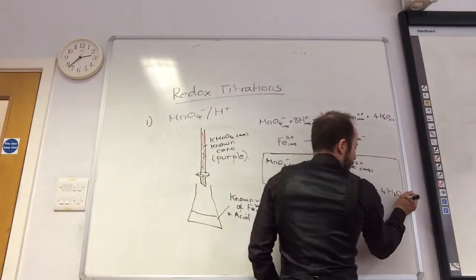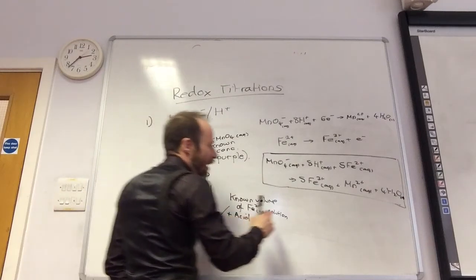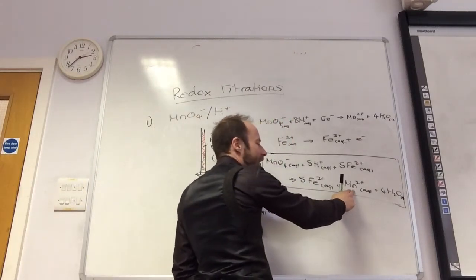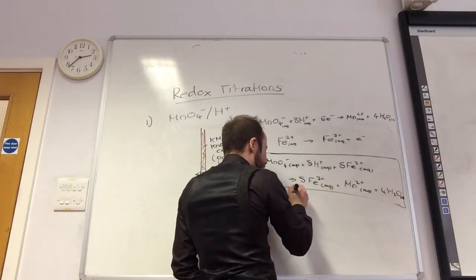So your end point is when you see a sort of pale pink colour persist. Now this is very, you'll see it, Mn2 plus is very, very pale pink.